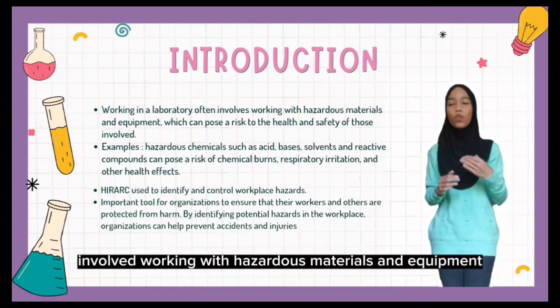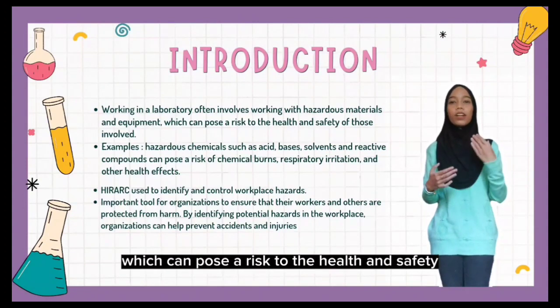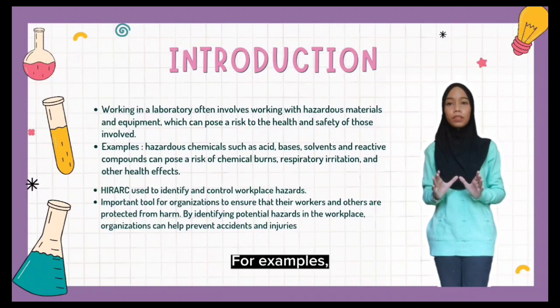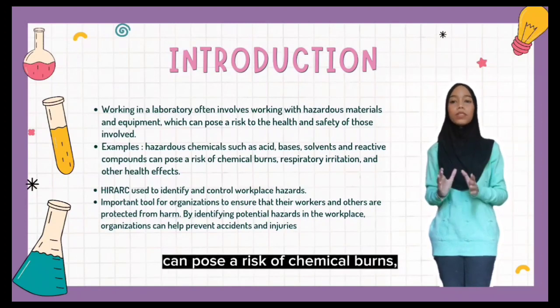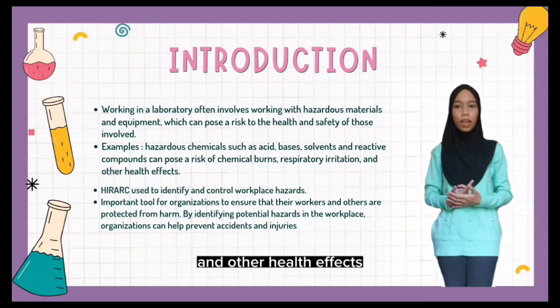Laboratory activities often involve working with hazardous material and equipment, which can pose a risk to the health and safety of those involved. For example, handling hazardous chemicals such as acids, bases, solvents, and reactive compounds can pose a risk of chemical burns, respiratory irritation, and other health effects.